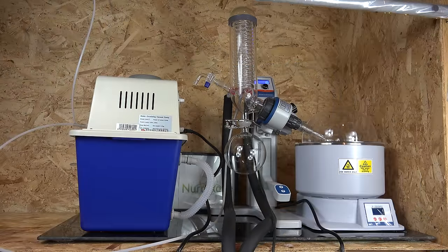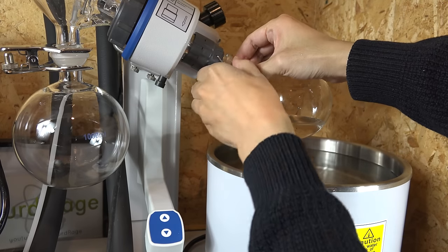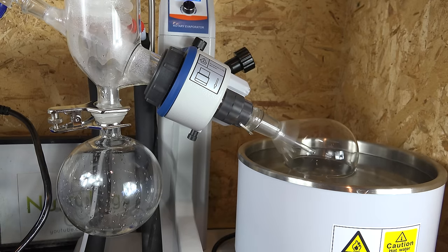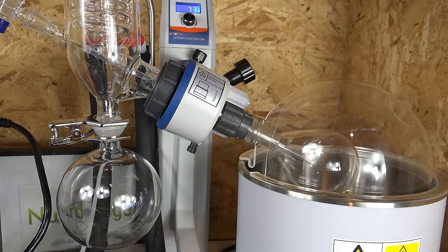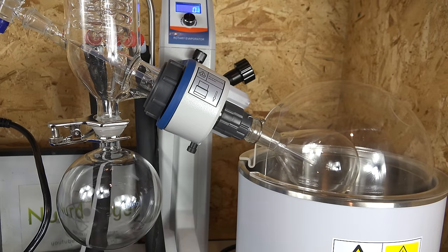Here is the complete system all set up. The sample is placed in the flask and heated by the water bath. The solvent vapors travel up through to the condenser where they are condensed and collected, and the product is left behind in the flask. The most obvious feature — and where the machine gets its name — is the ability to rotate the flask while it's being evaporated. That's why it's called the rotary evaporator or rotovap. We can adjust the speed and handle mixtures of different viscosities and consistencies.